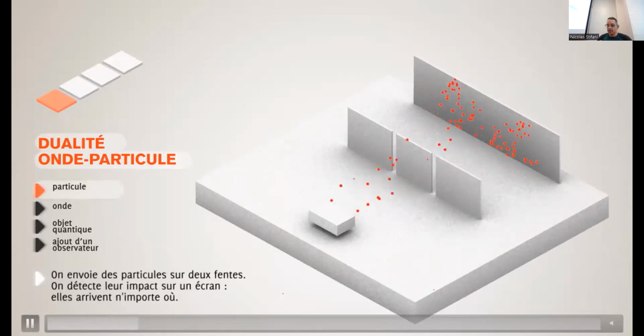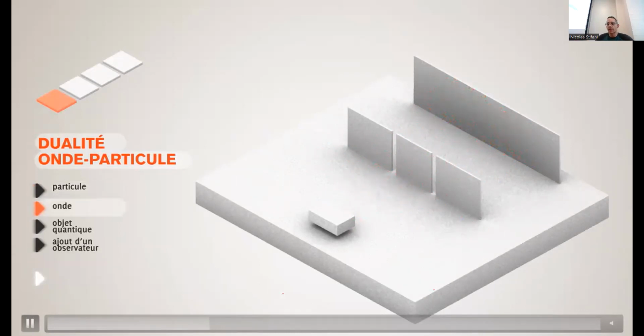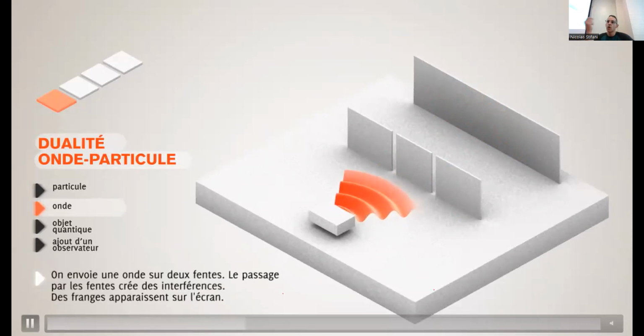But this is the experiment that shows that light is both a particle and a wave, and we can use the properties of each of them to do microscopy. And because it behaves like both, it's kind of hard to understand that you have actually a small dot, a quantum, and also a wave that can behave like a wave and actually behave like both.